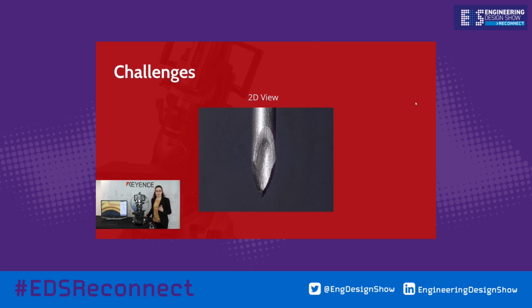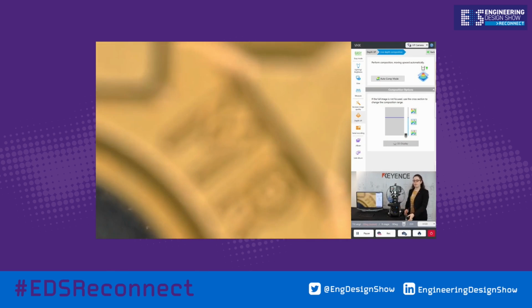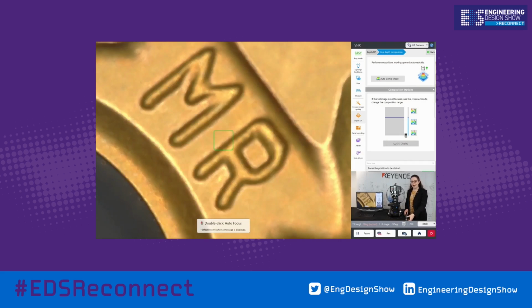Here we get very little information other than the colour of the sample, maybe some surface texture, but it is quite difficult with just a 2D image. So now I'm going to show you how we do this on our VHX. I'm going to go back to our cutting tool. If I just move over here, you might be able to see coming into focus an M and an R.